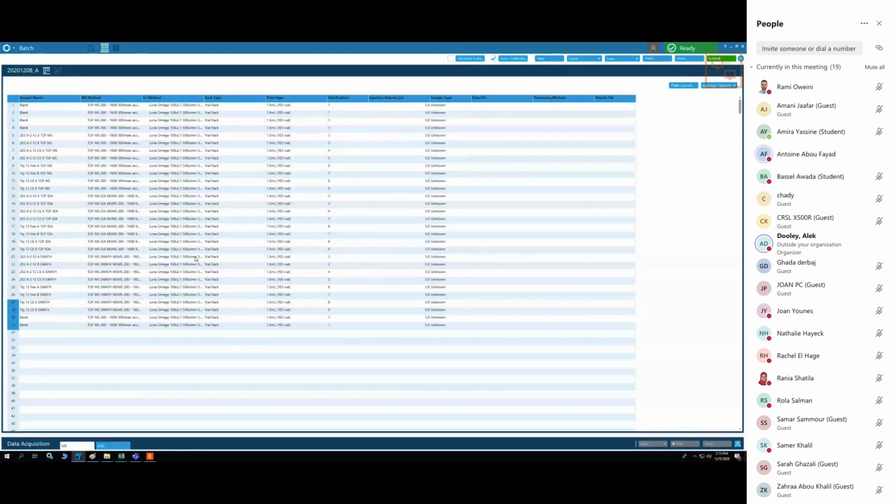So putting 1% DMSO in the mobile phase, I'm not sure that the interface will be able to handle that very well. I would be careful with that. If you can do without it, I would try that. Having said that, we did also have a discussion about the LC having different solvent channels.